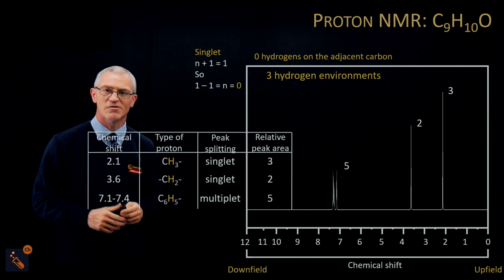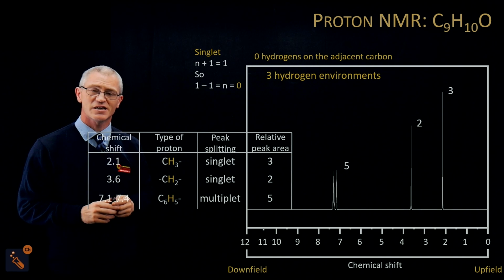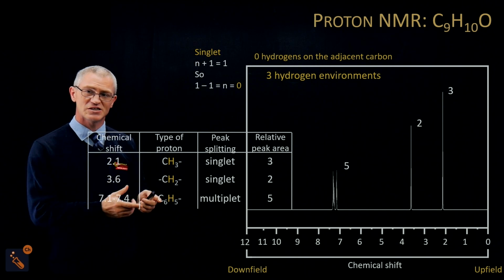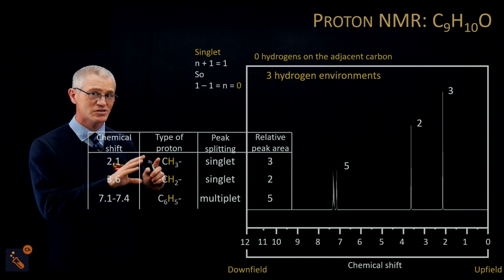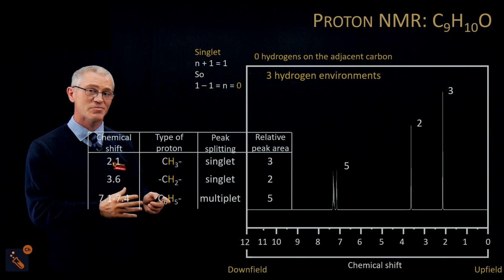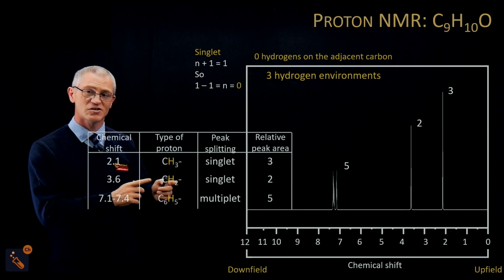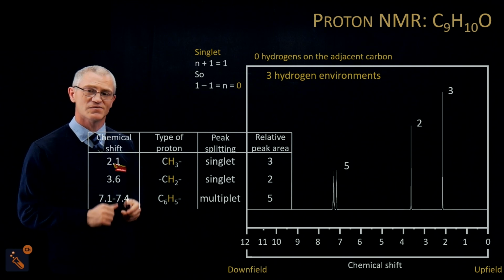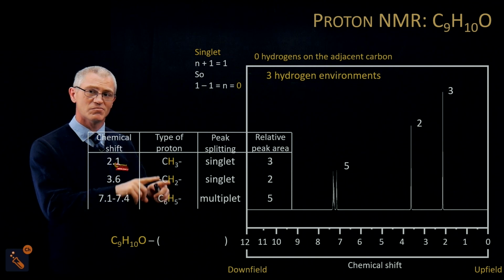Now, I'm going to teach you the next trick of doing this. You're given a molecular formula. So sometimes it's good to write down what you think it is. And as long as it's unambiguous, this will still get you marks, by the way. You have to put this so it's unambiguous. That's all. As long as they can tell exactly what hydrogen you think gave the peak, that's fine. So take the molecular formula and then minus these away.